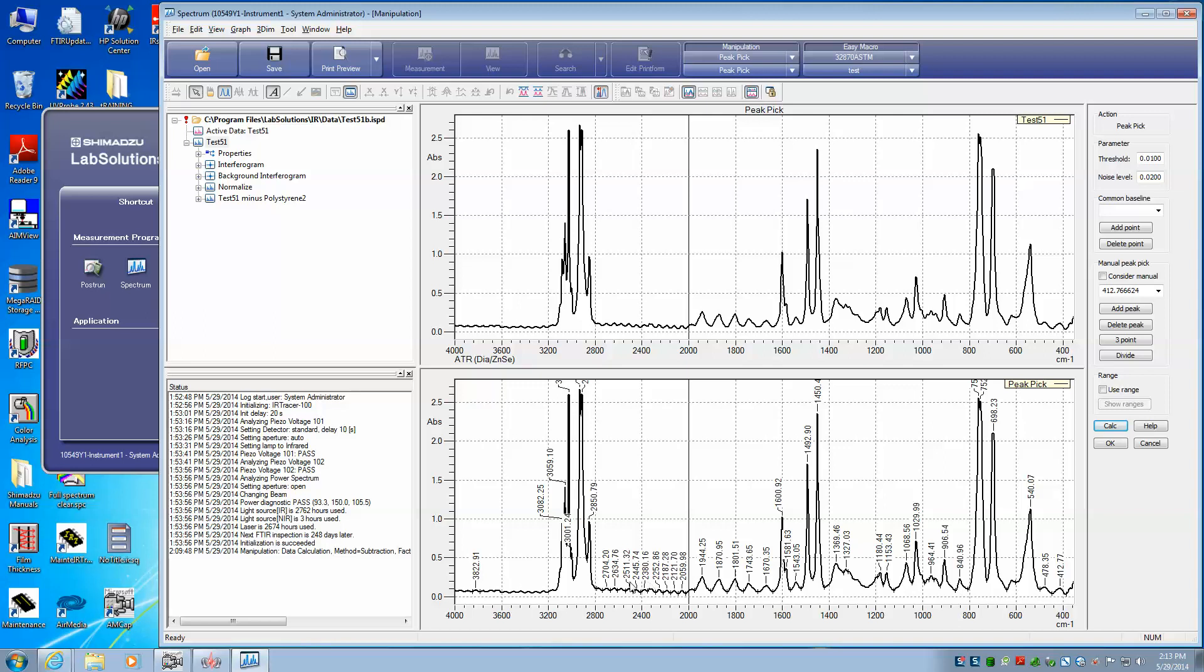Notice that our peak pick parameters are picking up a lot of this interference fringe. This is from the thickness of the polystyrene card we used, and we want to get rid of that.